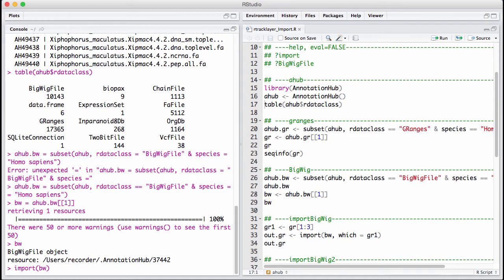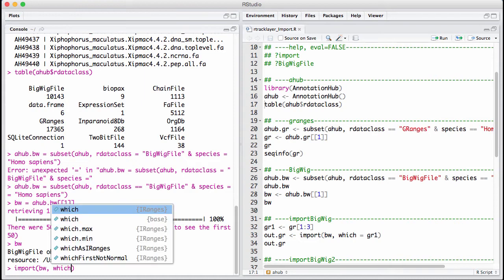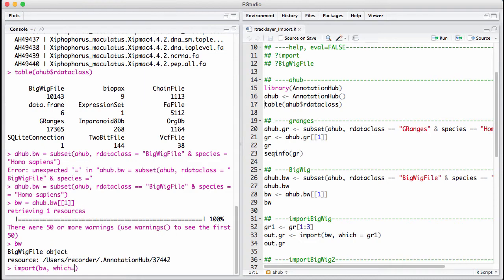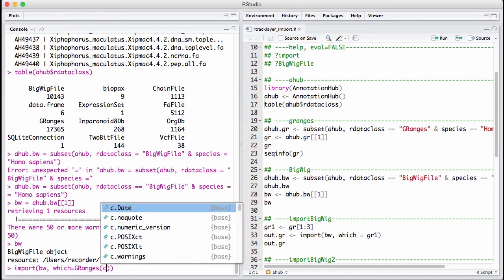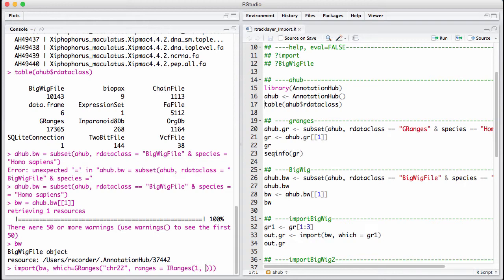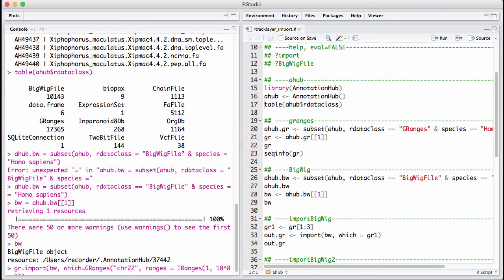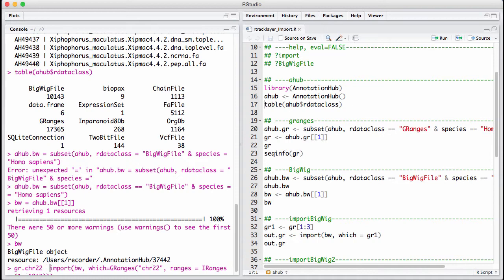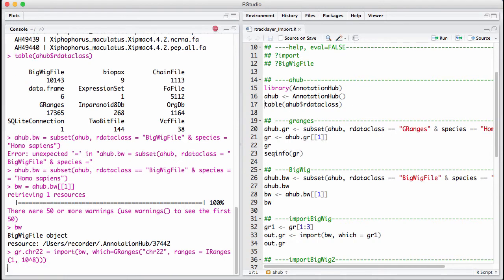Let's say we do that using the which argument, which is a GRanges. For example, say we just want to read in chromosome 22. I can never remember how big chromosome 22 is, but I know it's definitely less than 10 to the eighth. So this here will basically read in all of the data on chromosome 22 relatively fast.